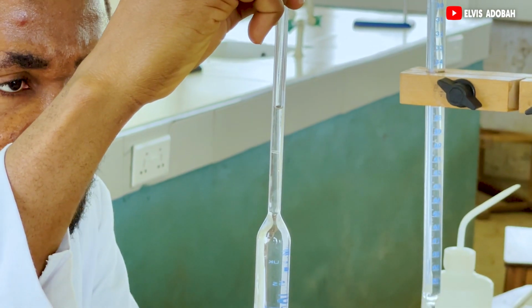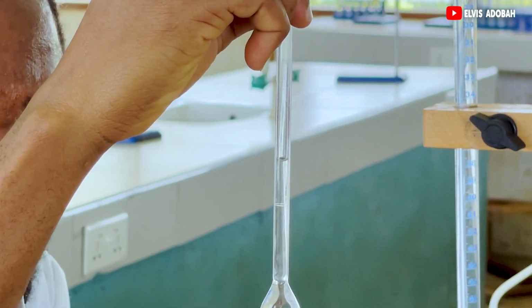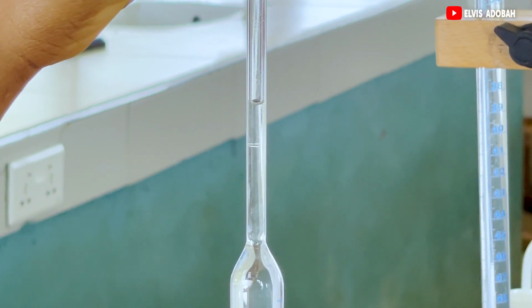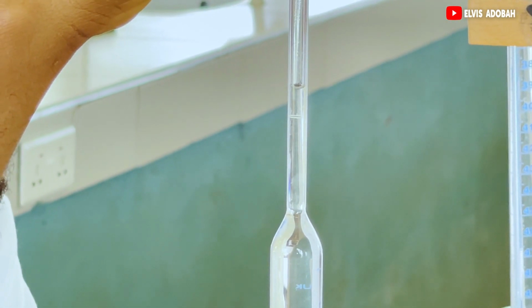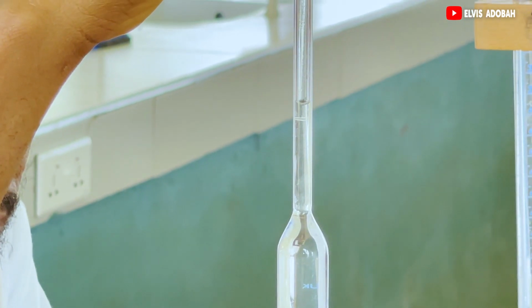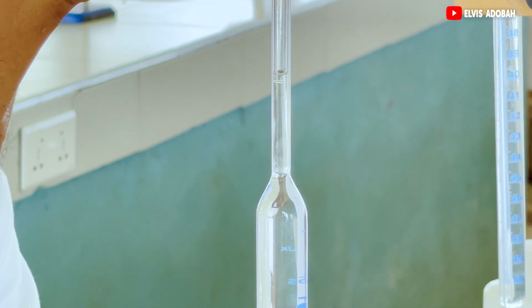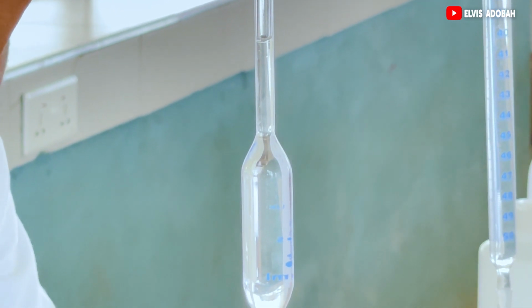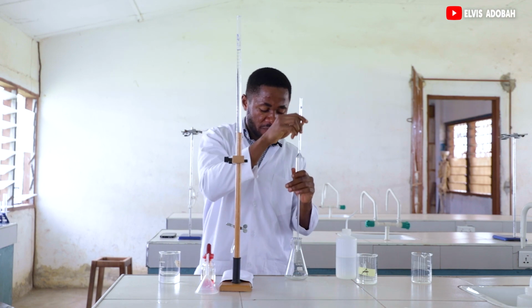Then we adjust, so the bottom of the meniscus is sitting on the mark. There we go. Then we transfer it into our conical flask.